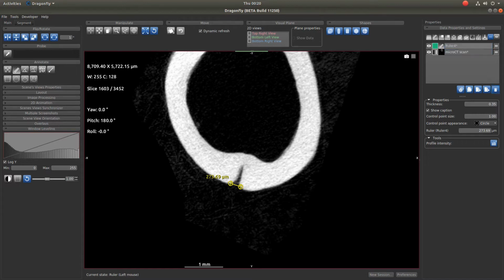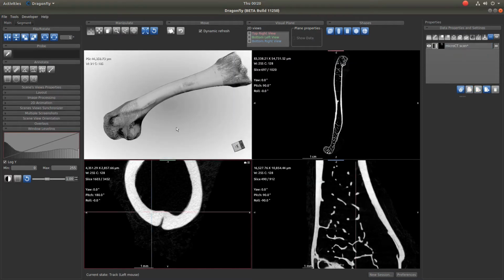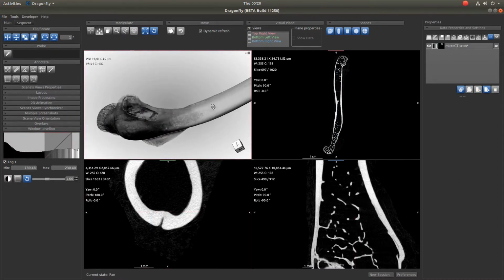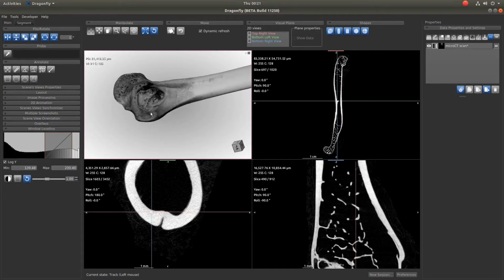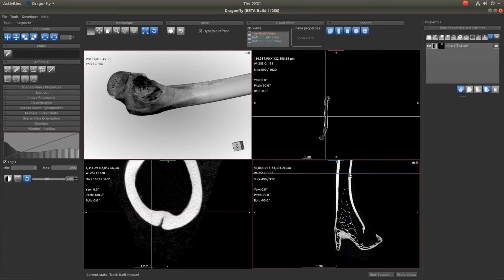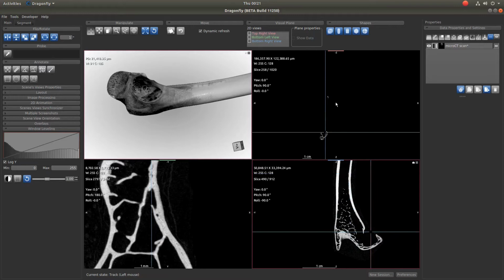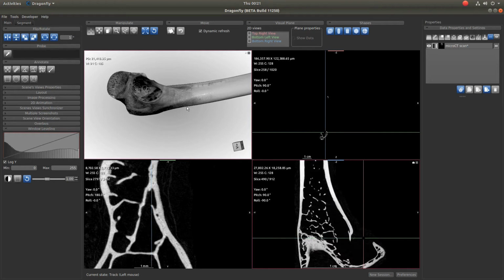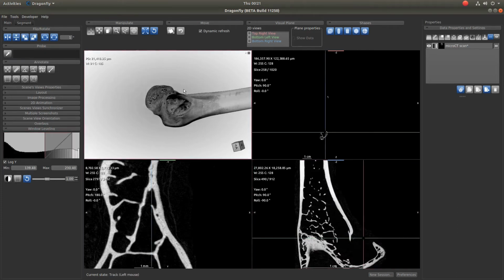So when we look at this bone, one of the things that grab your attention is, unlike long bones from other animals, there is this particular structure here. And what we see is there is a very large gap in the cortical bone. And that's there evolutionarily intended. In birds, there is this air sac that's part of the humerus, and that's part of the avian respiratory system. During our segmentation, we'll have a closer look at that, and we'll apply an artificial cap that will help us get a proper segmentation of cortical and trabecular.